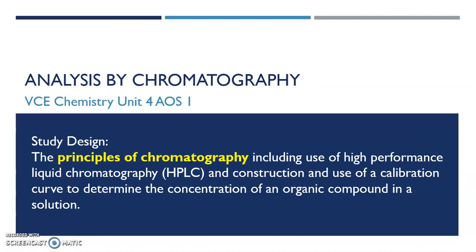VCE Chemistry, Unit 4, AOS 1, Analysis by Chromatography. So in this video, we will address the principles of all chromatography. And later on, we will go deeper into high-performance liquid chromatography.